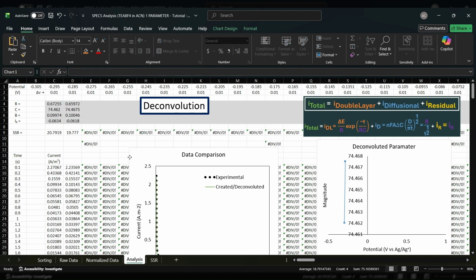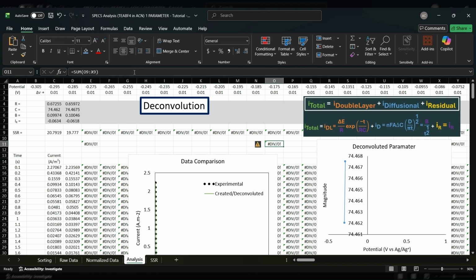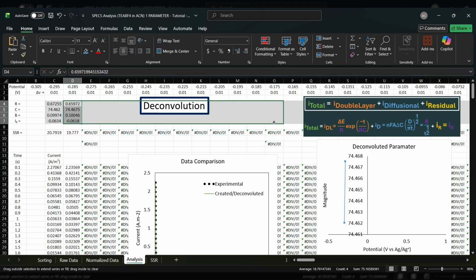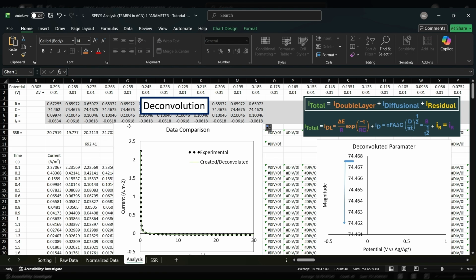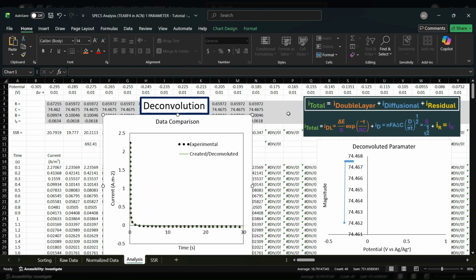To speed up this process, we do it in blocks of 10. So the sum of square residuals will do it in blocks of 10. You just say, I would like to do that, and I will just drag it along to here. I will use Solver to minimize this by changing all of these. So you'll basically do that to make it a bit faster. You can absolutely use programming to make this faster. We also have a macro inbuilt that can do it automatically as you go along.